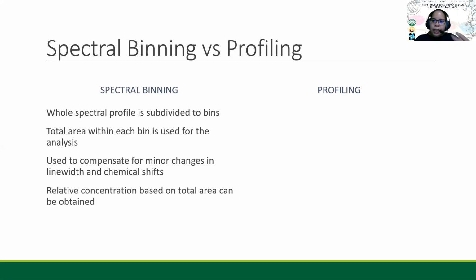So you can obtain relative concentration information based on the total area, and an internal standard is not required. You don't perform absolute quantitation. You can just do relative quantitation based on total peak area. And so, yun, hindi kailangan yung internal standard.